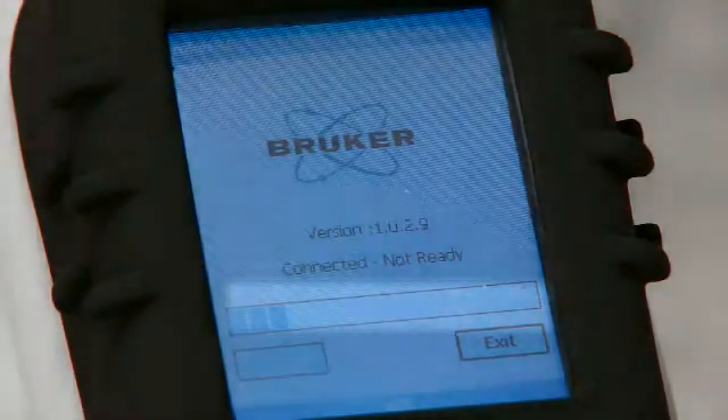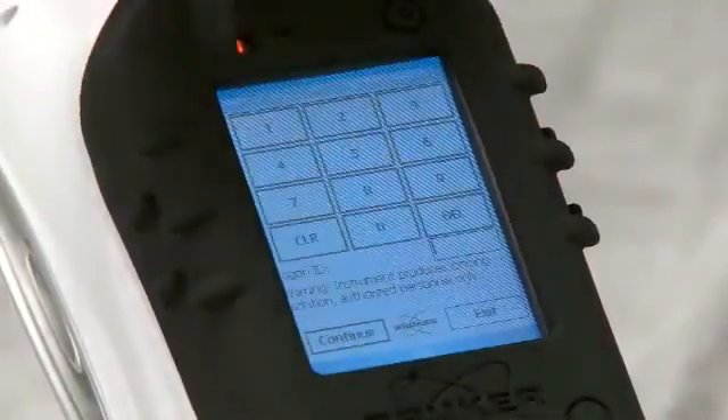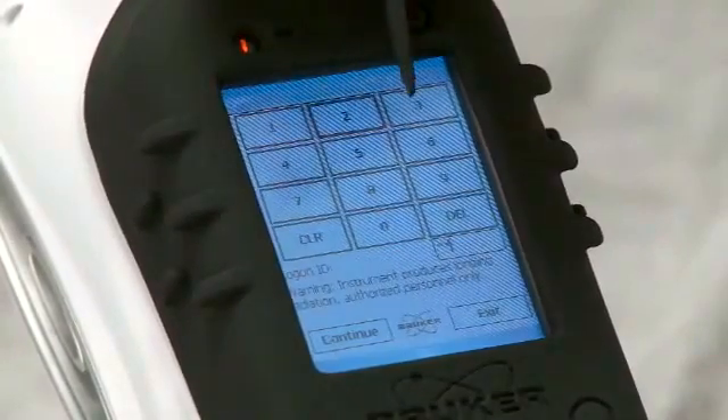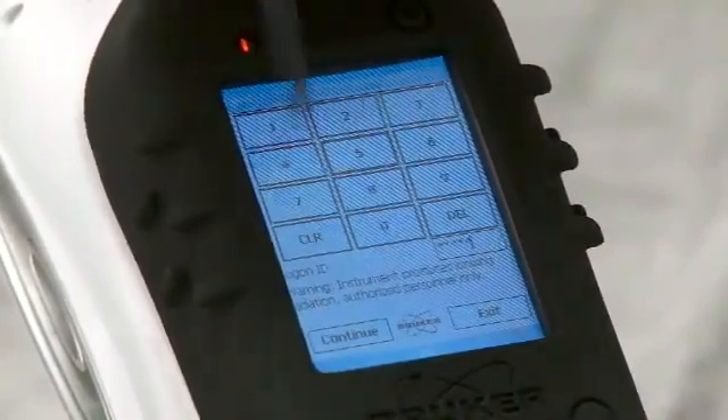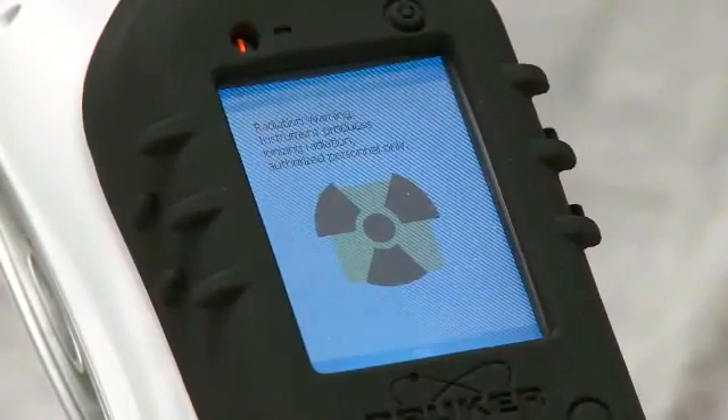The status bar will generally shrink, giving the user the ability to log on. Tap the log on box and enter the password — one, two, three, four, five — and tap continue. At this time, a radiation safety warning will be shown for about 15 seconds.